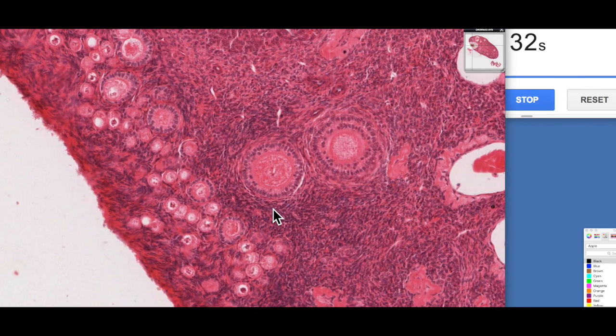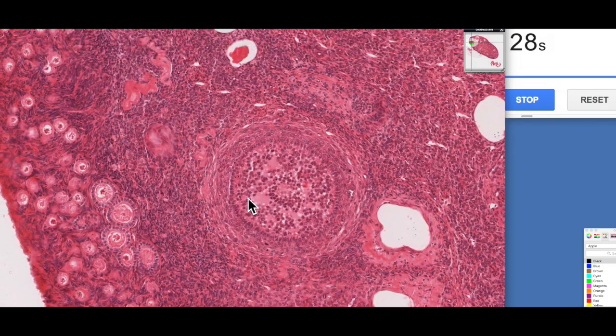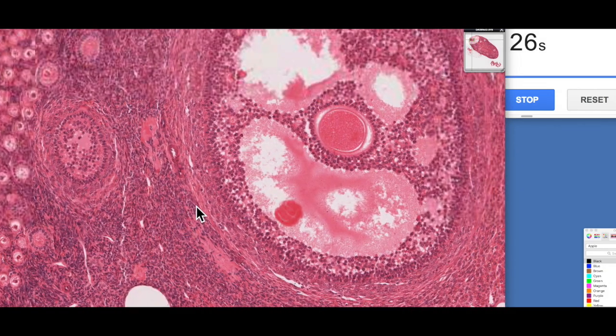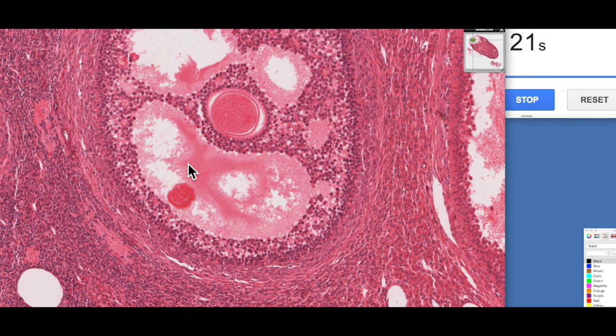But from then, the granulosa cells begin to secrete fluid. So if we zoom around, we can actually see some evidence of this fluid-filled space. This is known as an antrum. So once the fluid-filled space forms, these are known as secondary follicles.